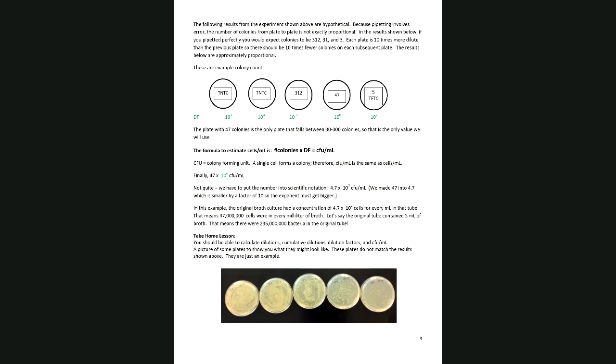And that is actually just using E. coli, because E. coli is a single bacterium. It doesn't stick to other E. coli cells, because if the bacteria stick together, that creates a problem. If you have a cluster of cells, the spectrophotometer cannot interpret the number of cells that are there in the cluster.